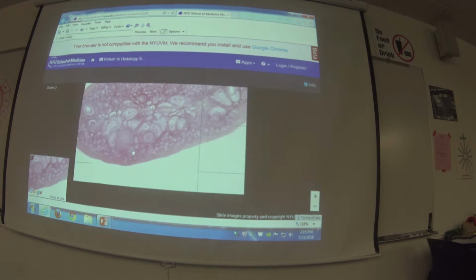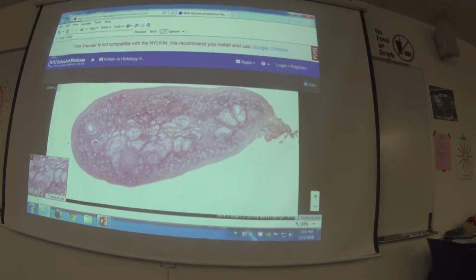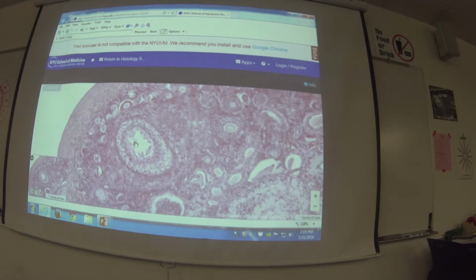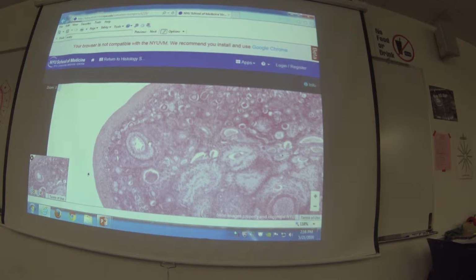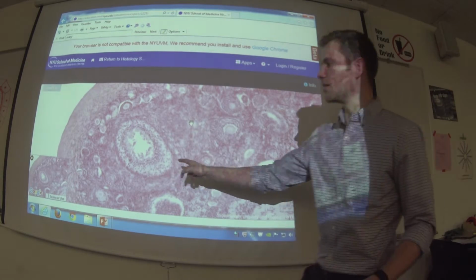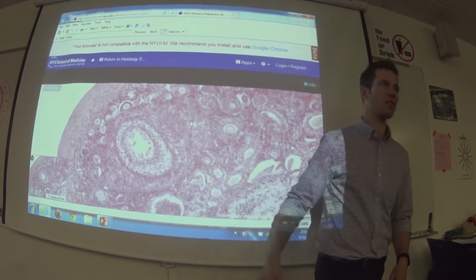And I don't think there are any tertiary follicles. Oh, maybe over here. That one's kind of broken through. So it's not a great example, but this gives you an idea of the size. A mature follicle, the biggest follicle, is at least this big, usually much larger.